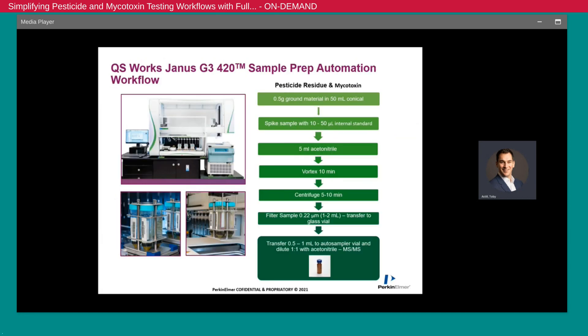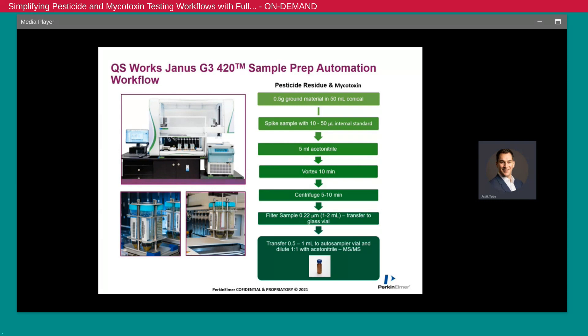Let's take a look specifically at the Janus 420. This is the first fully automated sample preparation platform for cannabis and hemp pesticide and mycotoxin testing. It incorporates technologies to vortex, centrifuge, mix, filter, and transfer liquid and standards across the workflow. The final result is that a flower sample at the beginning is converted to being in a two-milliliter HPLC vial that can go straight onto the mass spectrometer.